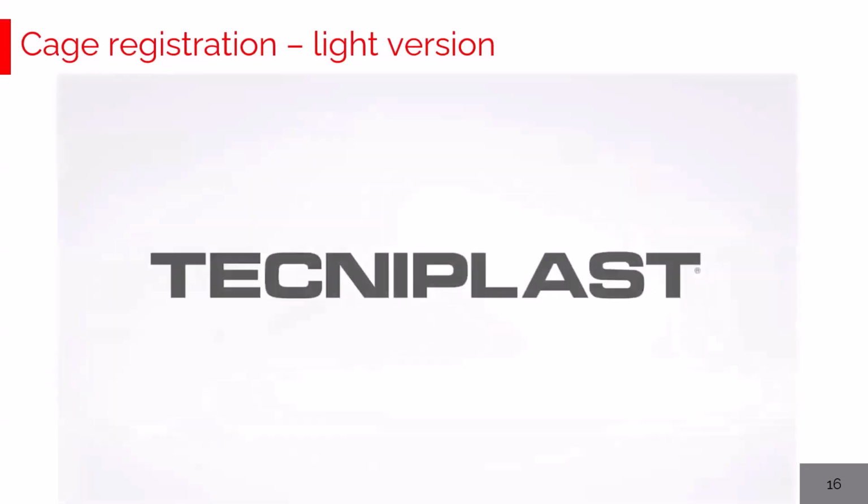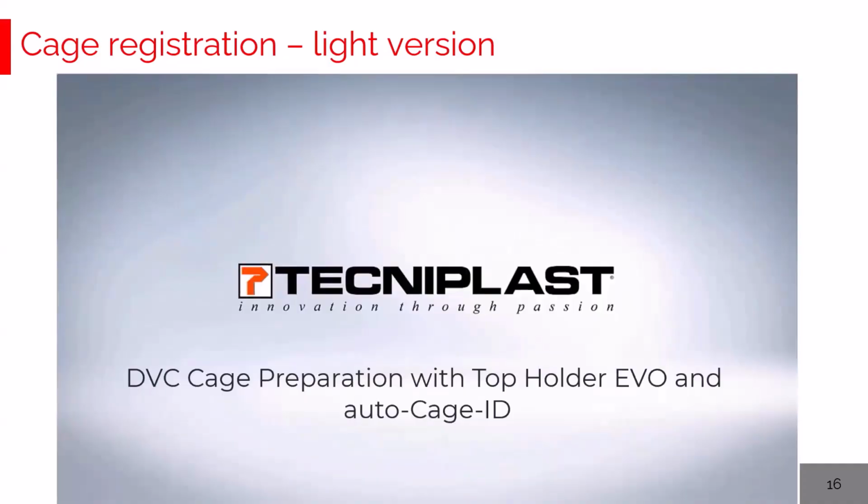There could be a light version. I show you immediately, and then we discuss.